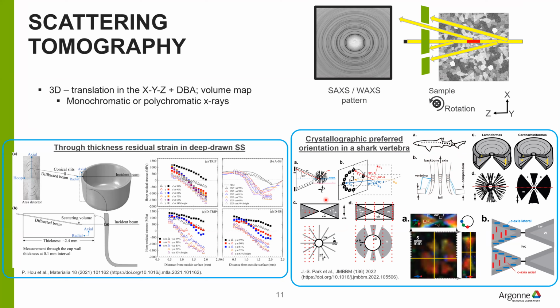So we're looking at this bone structure that, as a cartoon picture, would look something like this in 3D. When we try to measure it with energy dispersive diffraction, you have a detector like this in a horseshoe pattern, looking at different scattering vectors.